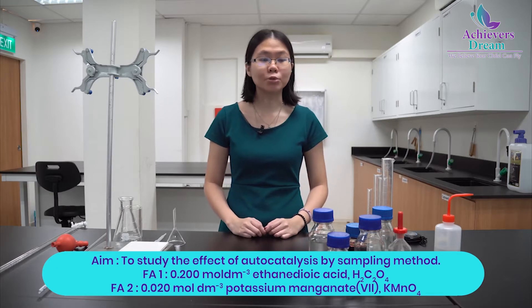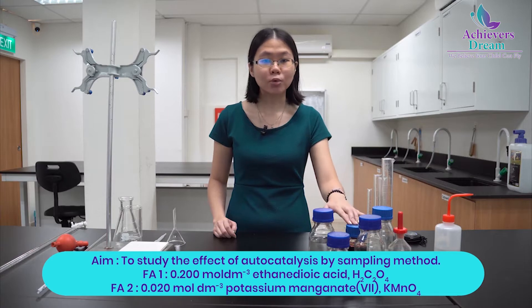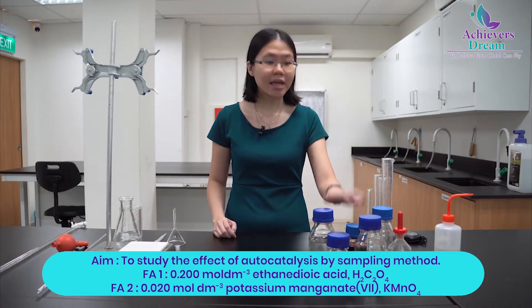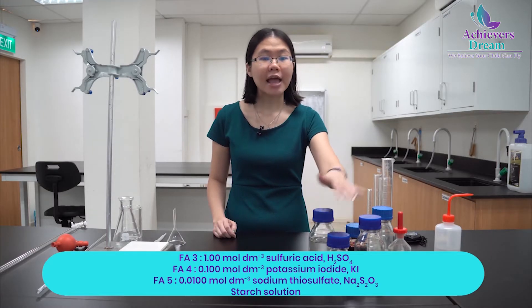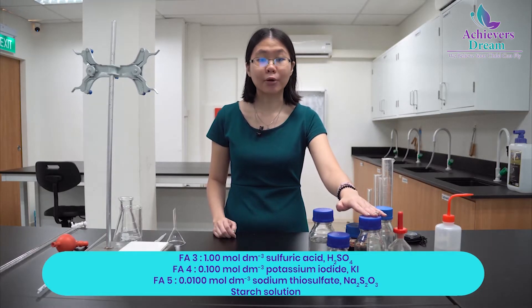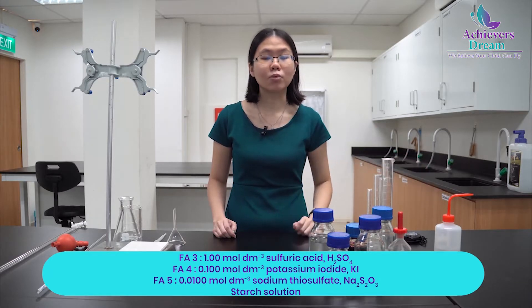You will be provided with 5 solutions: FA1 which is your ethanedioic acid, FA2 is potassium manganate 7, FA3 is your sulfuric acid, FA4 which is your potassium iodide, and FA5 is sodium thiosulfate. You are also provided with starch indicator and distilled water.